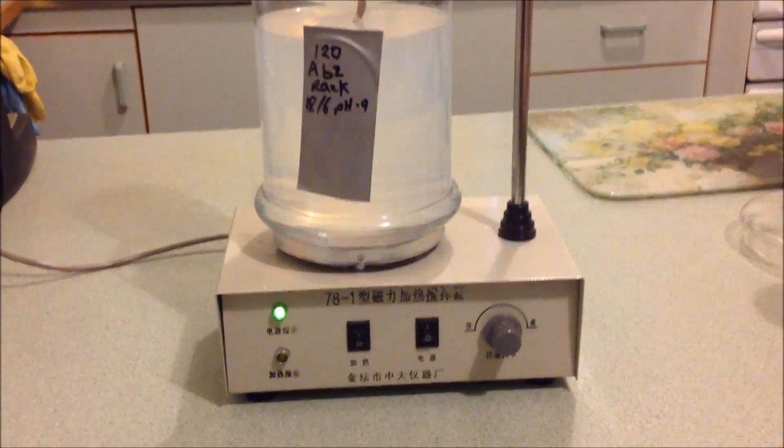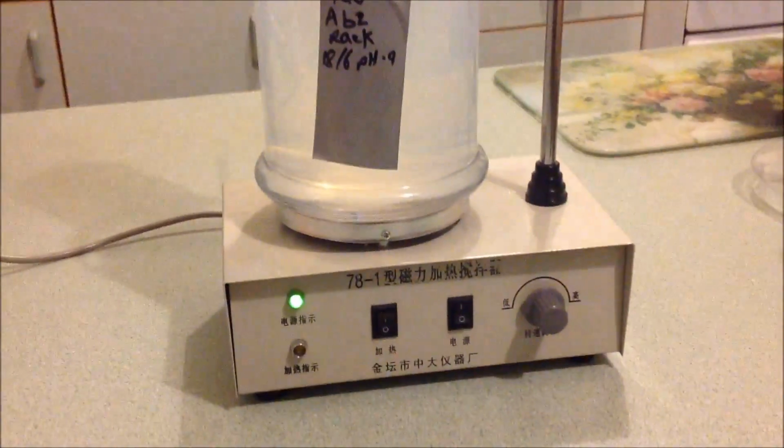Just using 2 meters there just to be sure. So 1.05 mil of 30% sodium hydroxide was able to do it. And just try and catch the Ormus forming. Look, I think you can see it there. I'll leave that. And here's the setup I'm using this time.